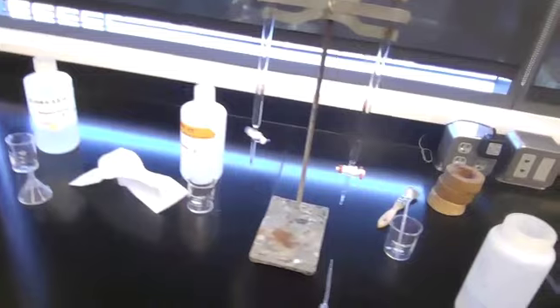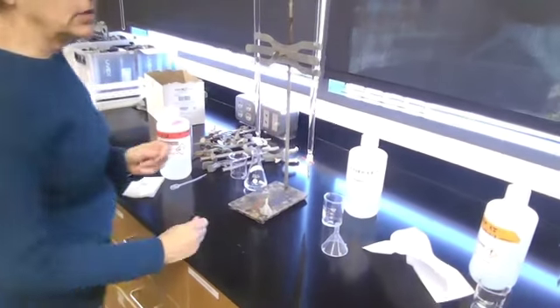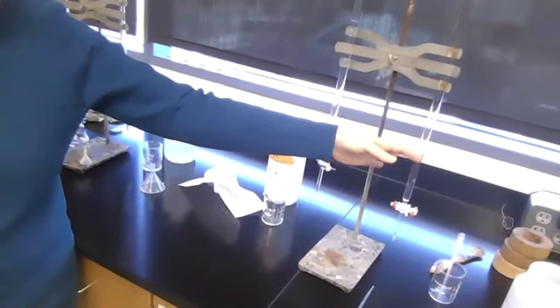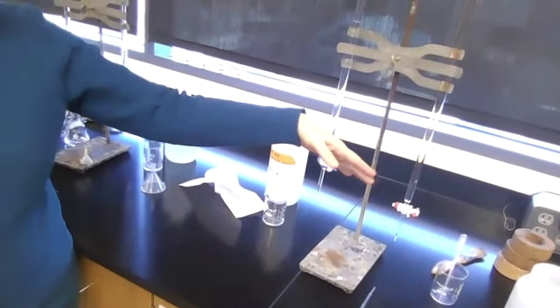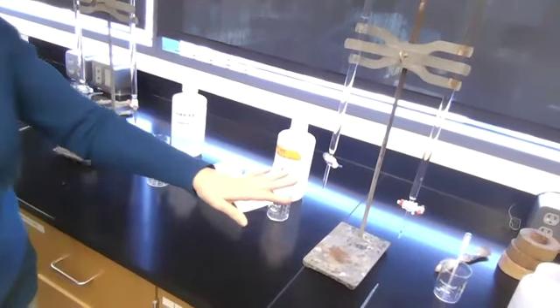Dr. Coons has set up burettes to dispense the reagents. You want to go through each one of those? What's that one there? The 4 reagents in our reaction today are sodium thiosulfate, which is always in constant amount. So that's our clock for this reaction. We will always be making or using up the same amount of thiosulfate in every reaction.